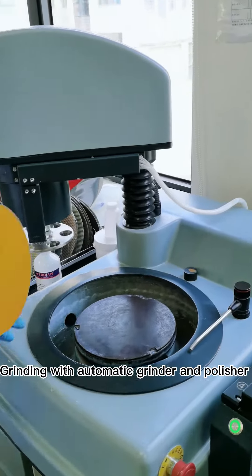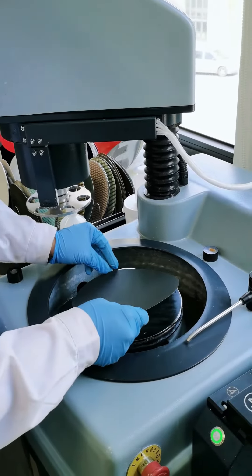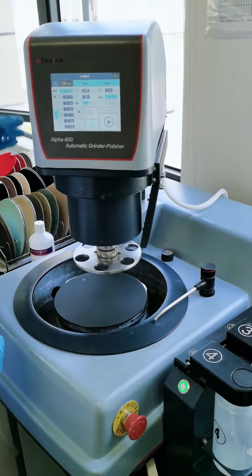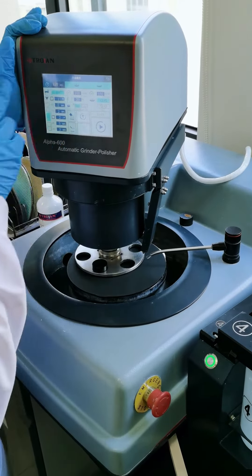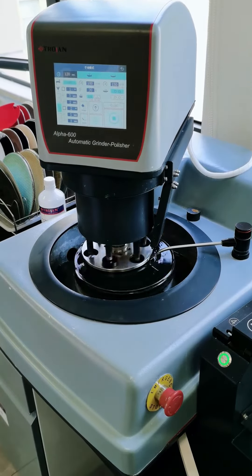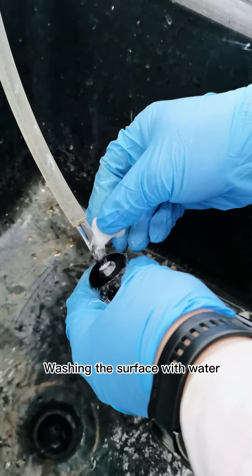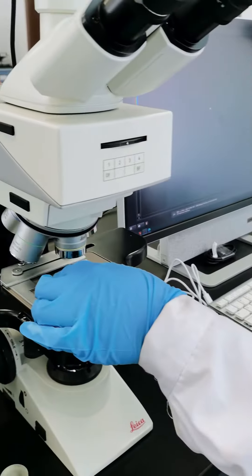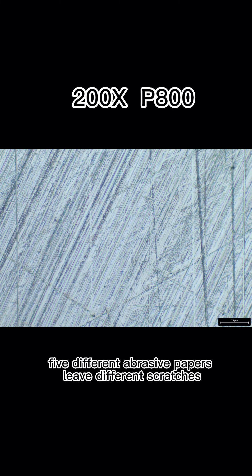Grind with the automatic grinder and polisher. Wash the surface with water. Use 5 different grades of sandpaper, progressing through each grit, removing scratches from the previous step.